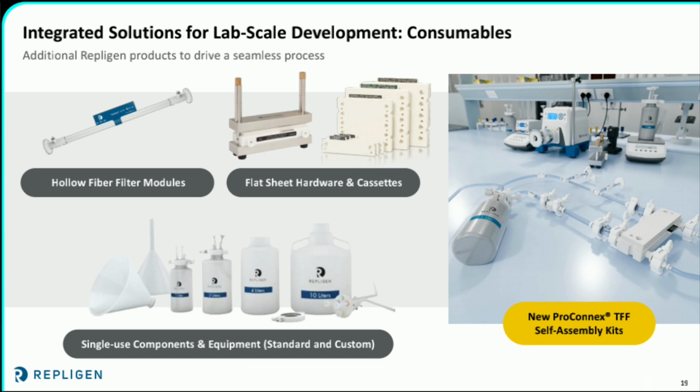We'd be more than happy to hear about what your pinch points are, what your needs are, etc., and develop a solution for you. Lastly, on the right, we've recently launched our ProConnex self-assembly kits. So these basically come with all of the materials that you would need to connect up to a KR2i. They include things like your filter, your bottle, your dip tube, all of that. So we have the self-assembly kits, and then we also have the fully assembled plug-and-play kits as well that are available, and these can come irradiated or non-irradiated as well.